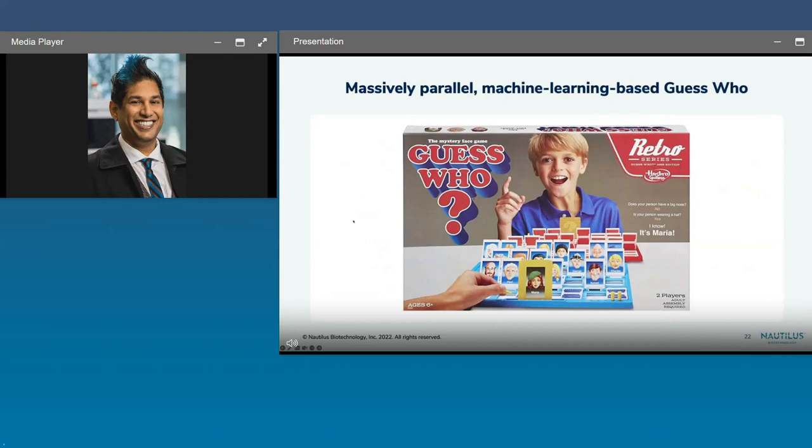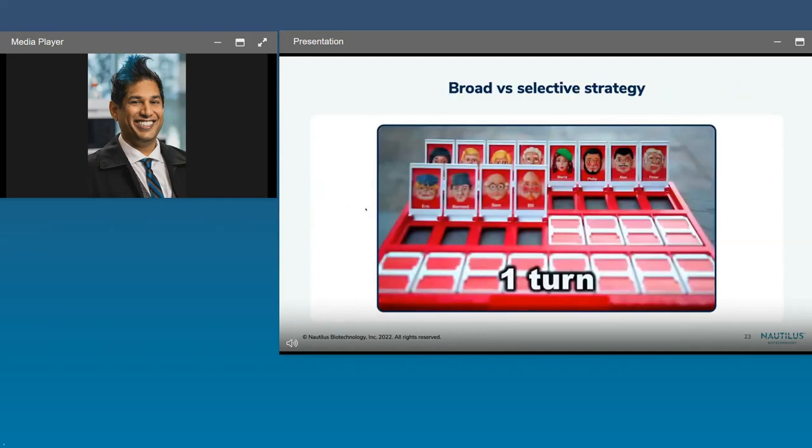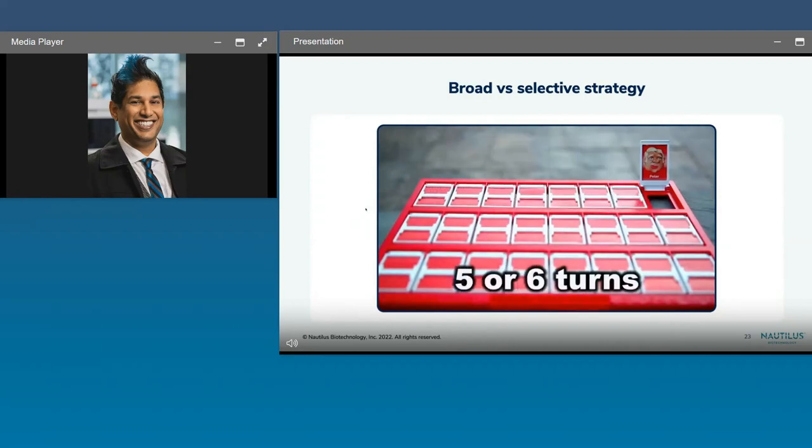At one particular location on the array, one way one could figure out the identity is by using tens of thousands of specific affinity reagent probes, essentially asking the question, are you Maria? Are you Robert? Are you Charles? Are you George? But that would require tens of thousands of perfect affinity reagents. It would also be extremely time consuming. So in Guess Who, what we do instead is we ask much less specific questions. We ask, are you wearing a hat? Are you bald? Are you wearing a mustache? And while these questions themselves are much more general and much less specific, one can arrive at the right answer shockingly efficiently through asking a series of less specific questions.